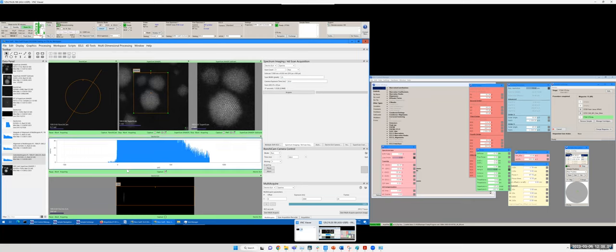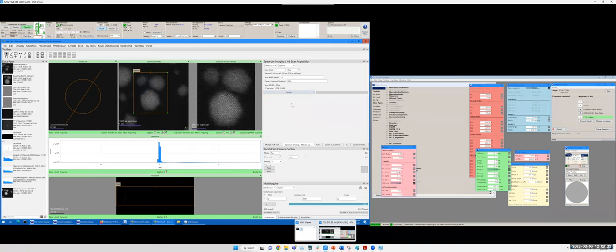Okay, so now you always want to check the EELS spectrometer showing correct data, like zero loss peak is aligned. Okay, now it's aligned. And then sometimes you forget the mode, you're in CCD mode, you don't have signal on the detector trace, and you click acquire, you record nothing. Those are some errors I made before. So you check the image, check the region, check signal on the detectors, everything looks perfect. And then now you click acquire and you will wait. And you will see the scanning process show up here somewhere, yeah.